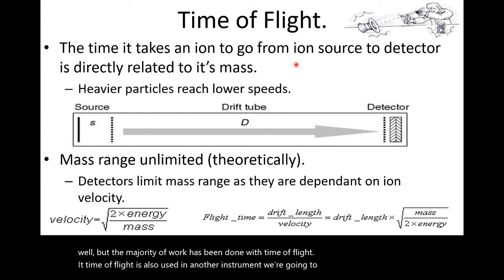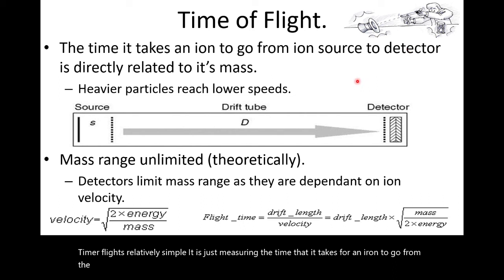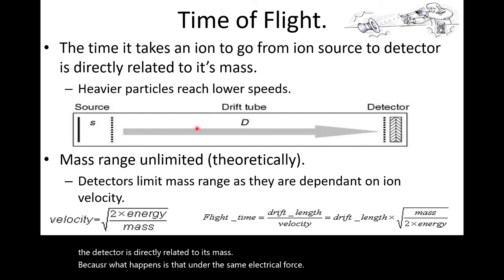It is just measuring the time that it takes for an ion to go from the source to the detector. And the length of time that it takes to go from this point to the detector is directly related to its mass. Because under the same electrical force, different size molecules will drift at different rates related to their mass through the flight tube.